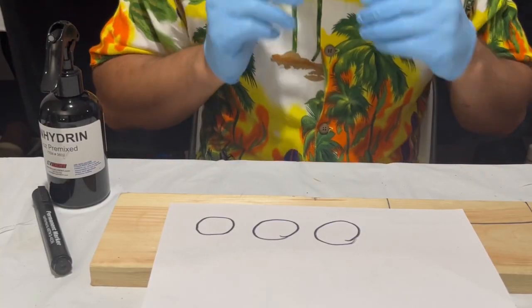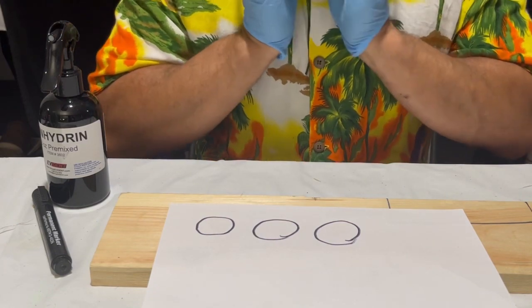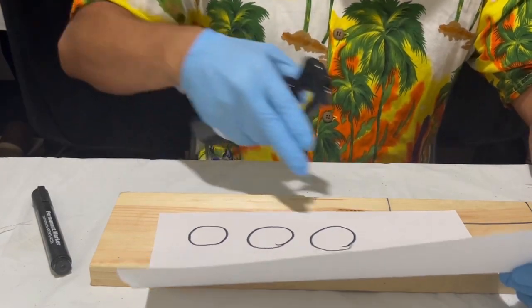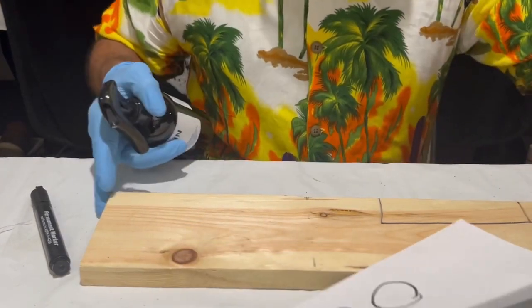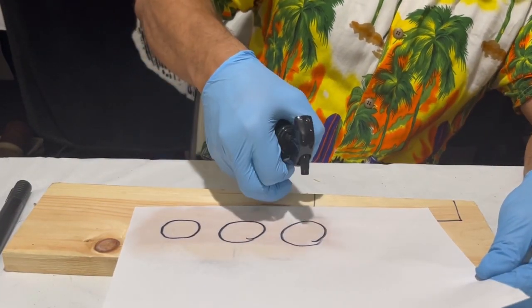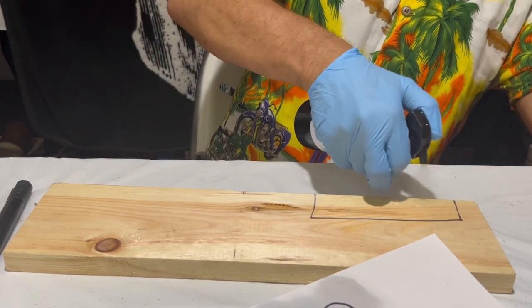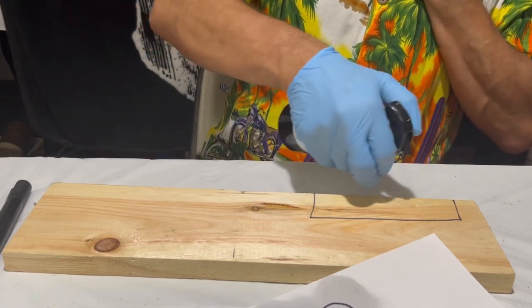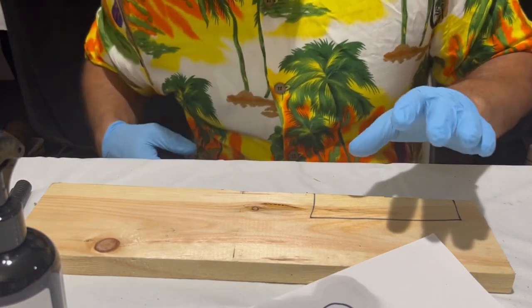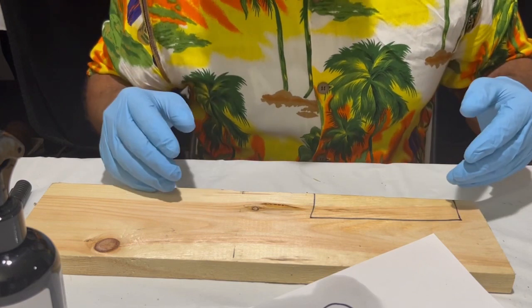I have my mask on so it might be a little muffled when I'm talking, because I'm wearing a very tight, strong mask — I told you this stuff is very toxic. I have my fingerprints here where you can see they're marked. I'm going to spray the fingerprints and let those soak for about two minutes, then we'll heat them up.